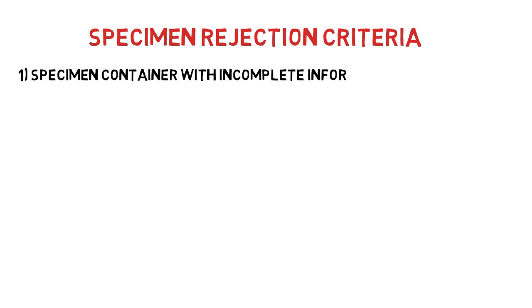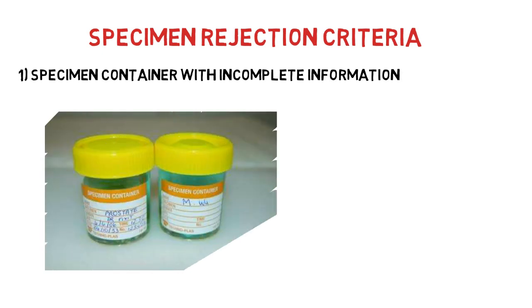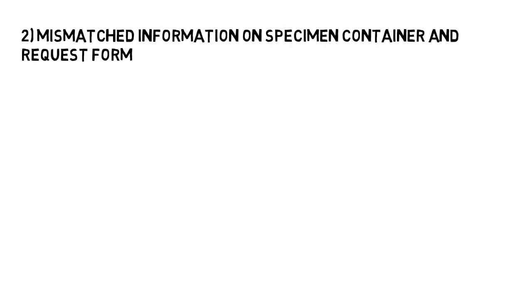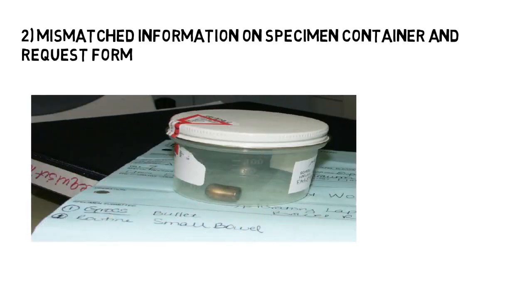Specimen rejection criteria. Number one, a specimen container with incomplete information must be rejected or subjected to inquiry. Number two, mismatching information on the specimen container and request form must be rejected.